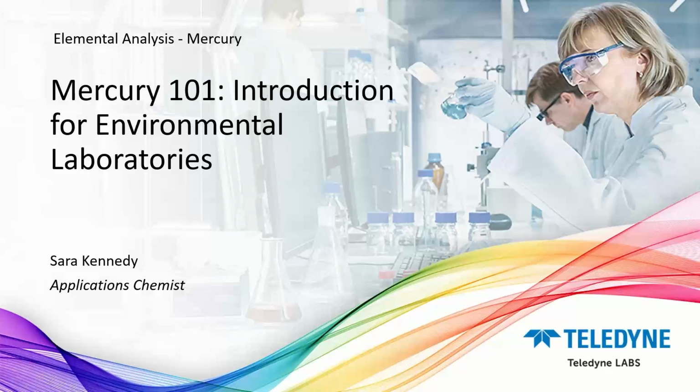Today's webinar will provide you with an understanding of mercury's unique characteristics, its impact on human health and the environment, and some essential techniques employed in environmental testing laboratories to monitor for mercury contamination.